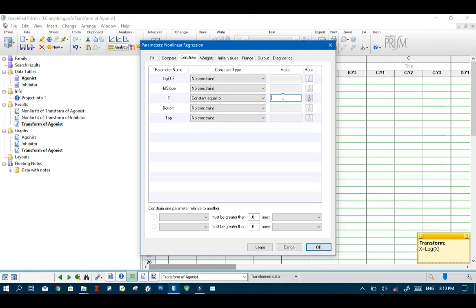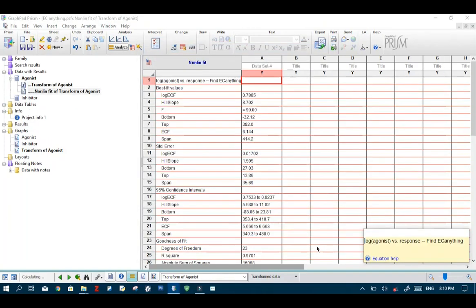So first of all we'll start with EC 90 for this example. And hit OK.